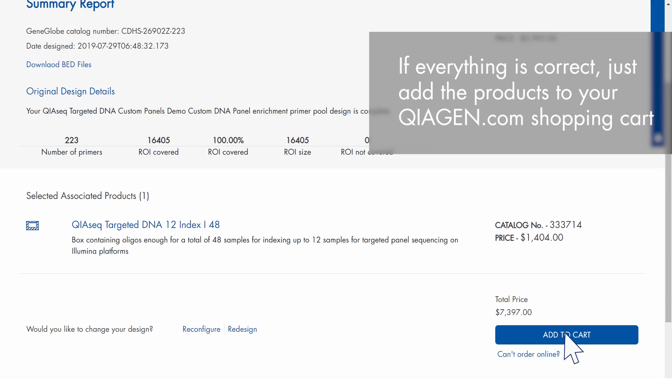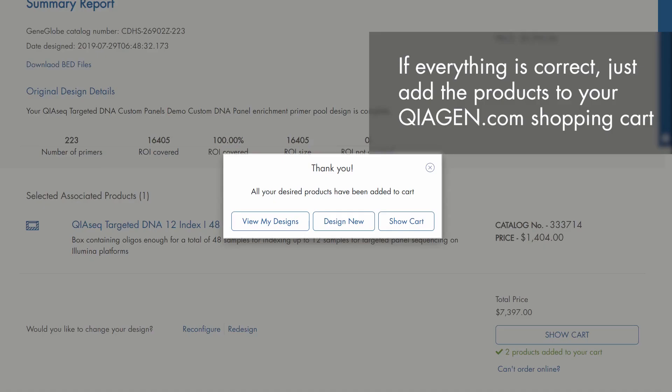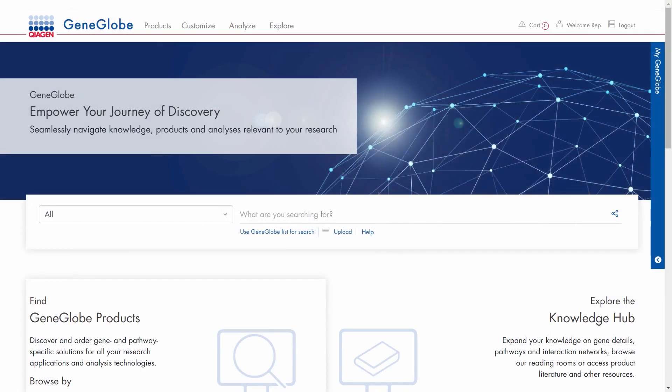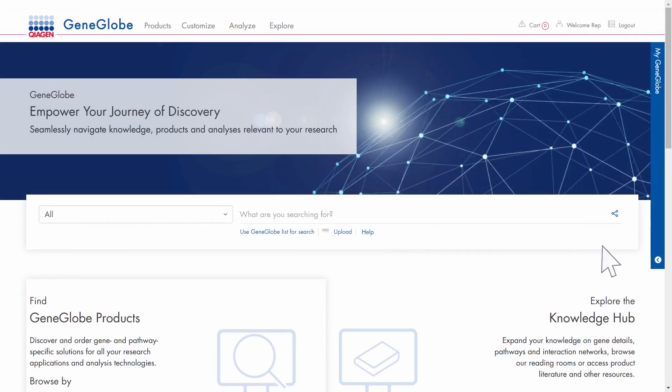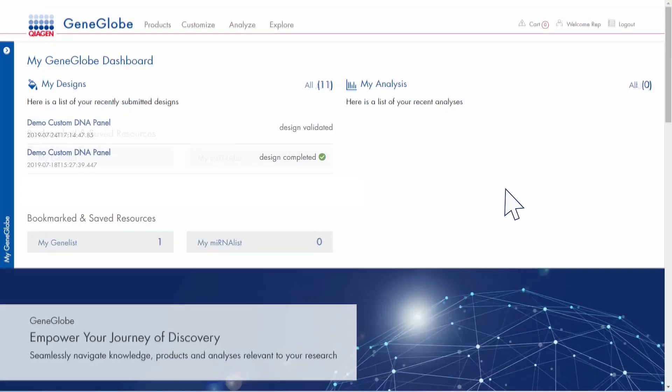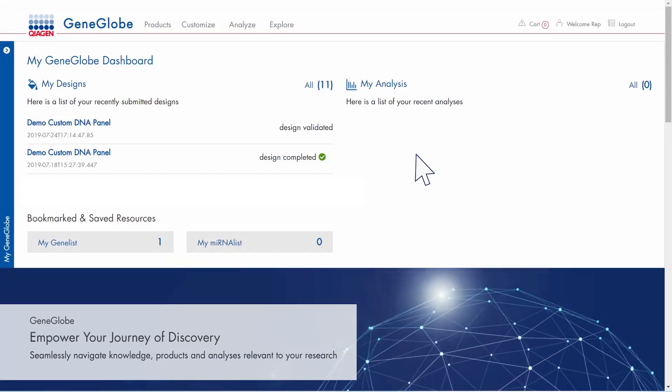If everything is correct, just add the products to your kiagen.com shopping cart. You can always access your design at a later time in the MyGeneGlobe dashboard.